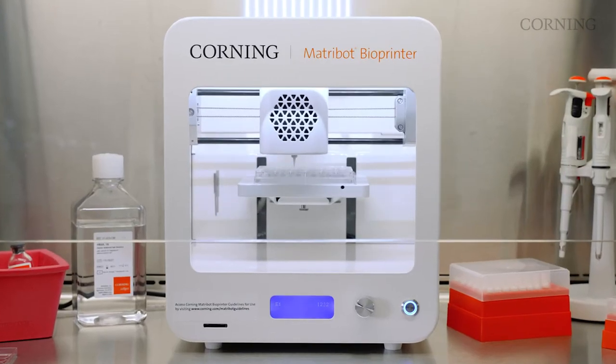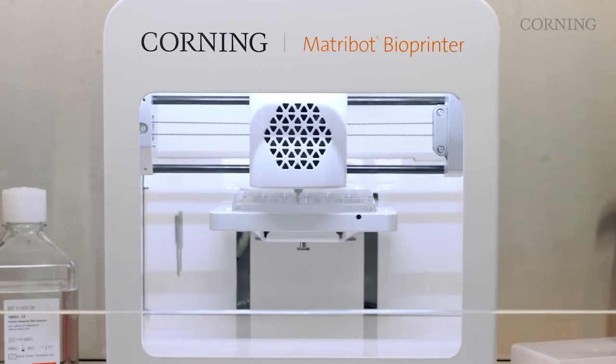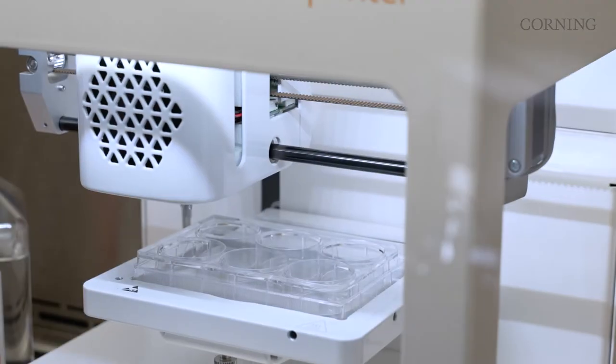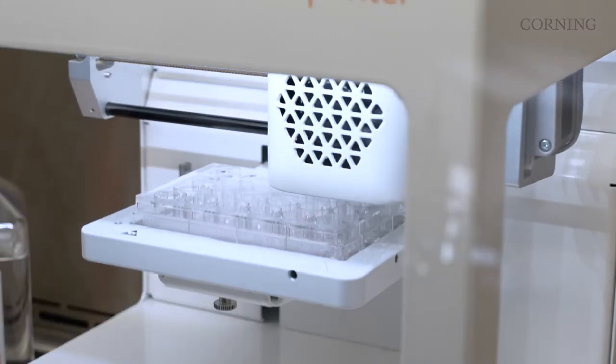Unlike other bioprinters, the Corning Matrobot bioprinter uses a syringe-based extrusion platform with temperature-controlled printheads, insulated nozzles, and a UV LED system that can dispense into a variety of low and high density vessel formats with precision and control.